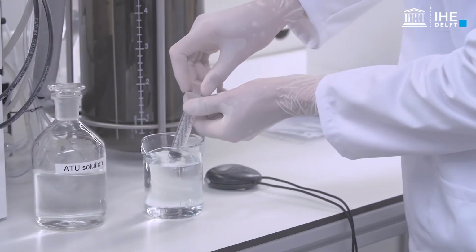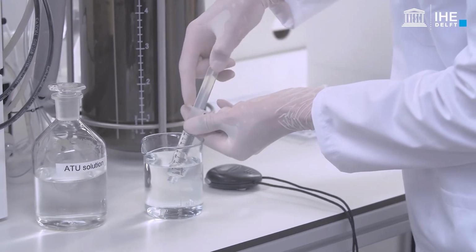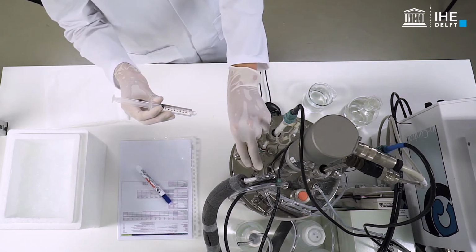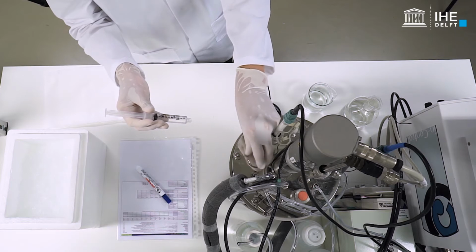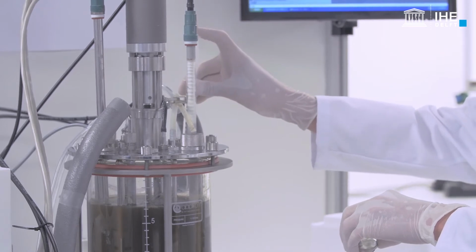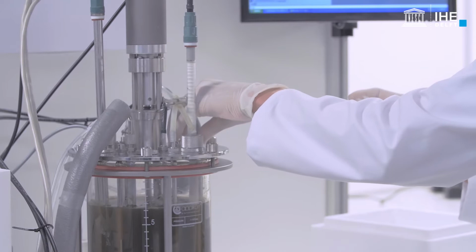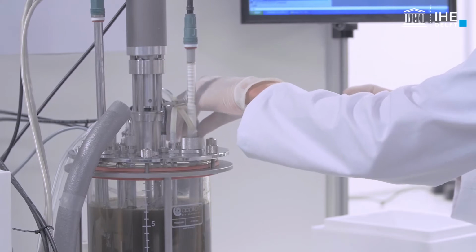If desired, allylthiourea, ATU, can be added. ATU will inhibit nitrification when the sludge is aerated. Usually, 20 milligrams per litre of ATU are sufficient to inhibit nitrification. After the addition of ATU, close the reactor.